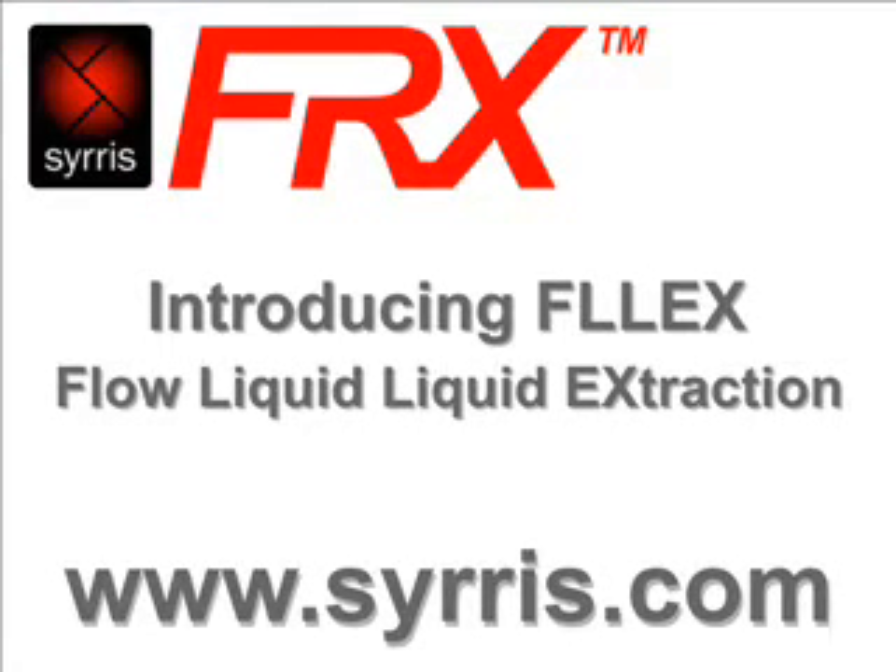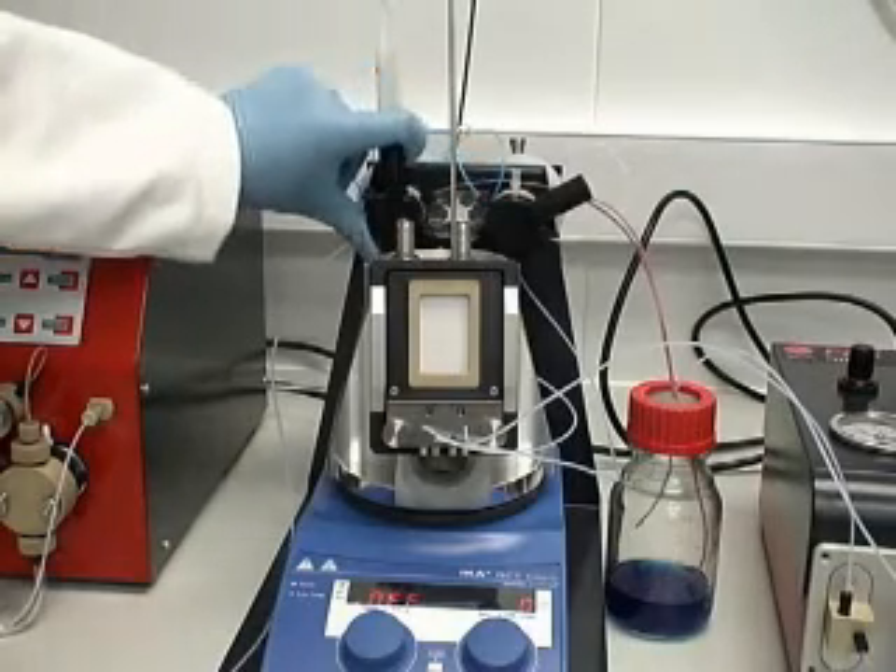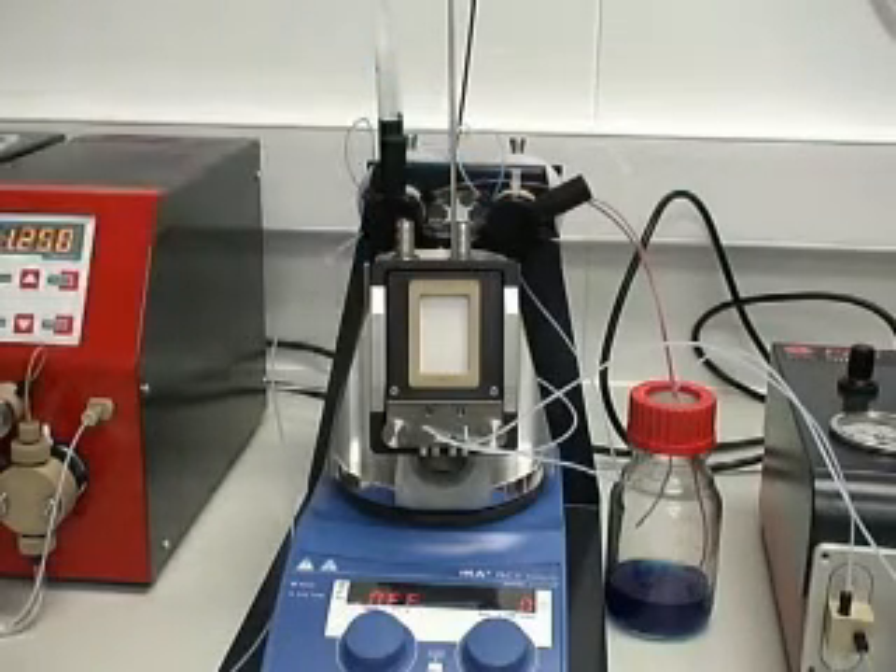FLEX is the flow liquid-liquid extraction module for FRX. This is the flow equivalent of a separating funnel, mixing two immiscible flow streams, allowing time for partitioning, and finally separating them.